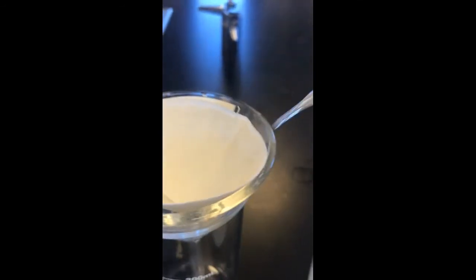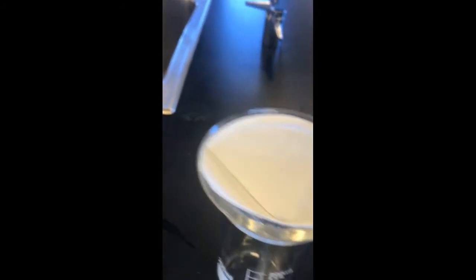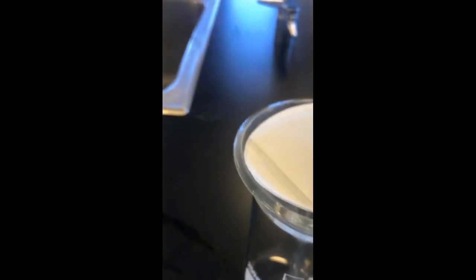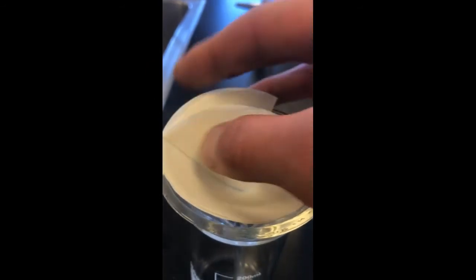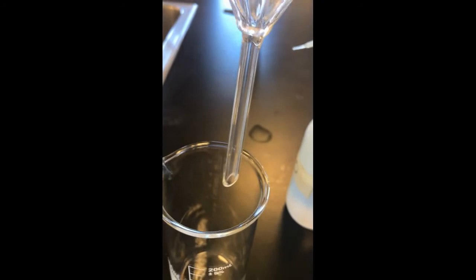And then I'm going to go through a process of decanting, where I take water and start rinsing it through and through and through to get the filter paper to catch only the solid and let all of the liquid filter and drain out through this funnel.